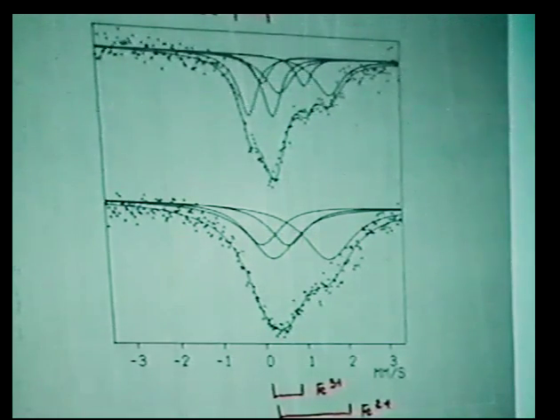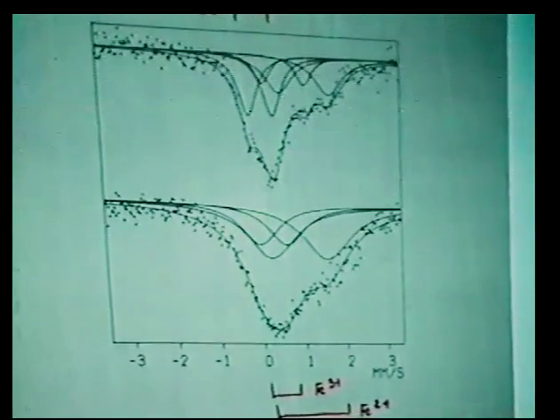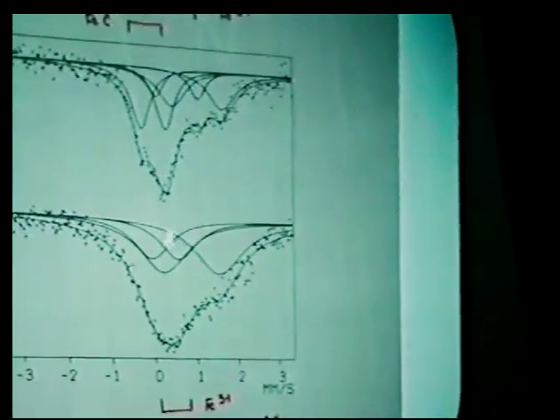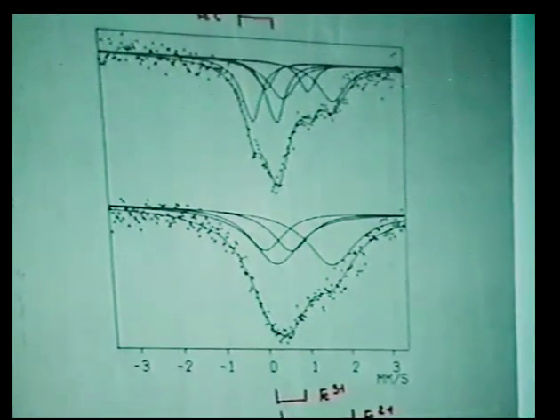So what we did during the reaction, we measured this spectra, and this is what we think is due to the reactive carbon here. And when you evacuated the system, it simply converted into iron-2 and iron-3 plus components. So in fact, during the reaction, we had a formation of a higher hydrocarbon plus methane.